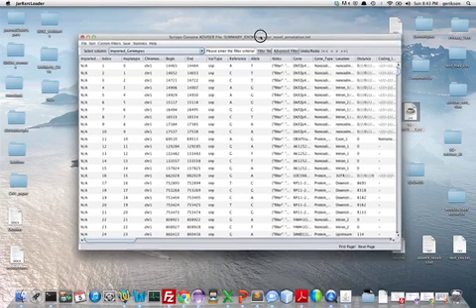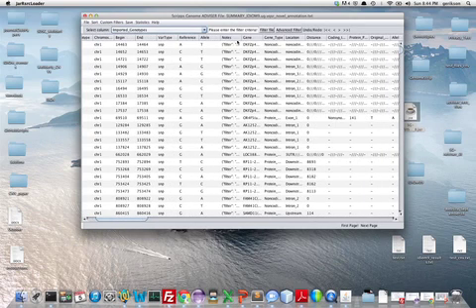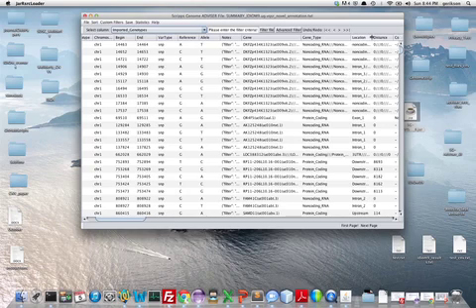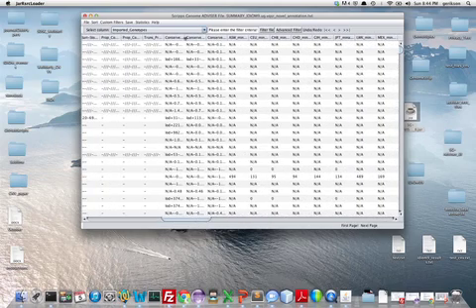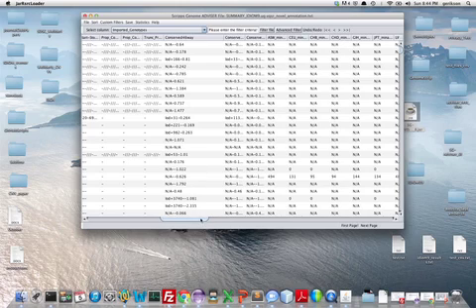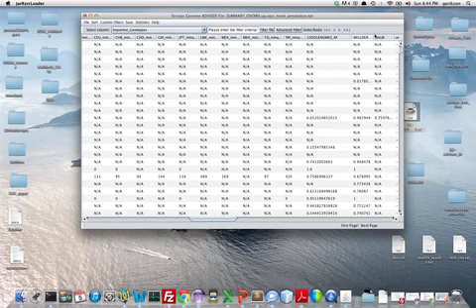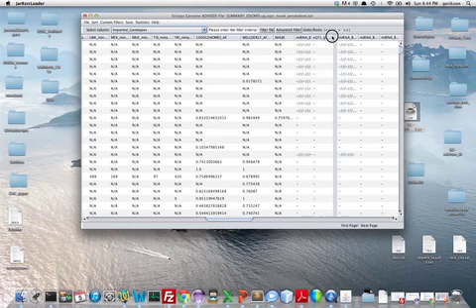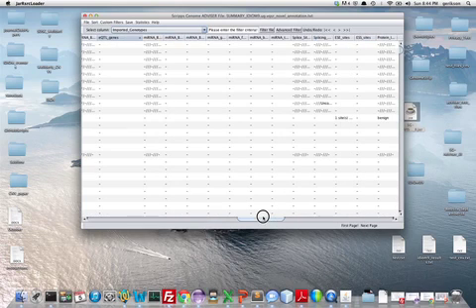So this is the tabulated view. You can see all of the annotations, from variant, gene annotation, gene type, non-coding RNA, location, downstream, upstream. Further down, you can see the conserved genes, allele frequency, 1000 Genomes, ExAC allele frequency, eQTL, epithelial genes, microRNA.